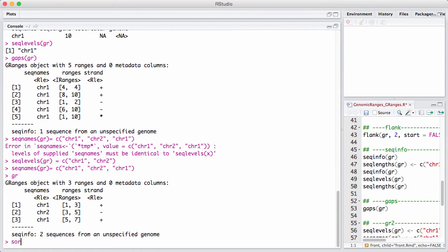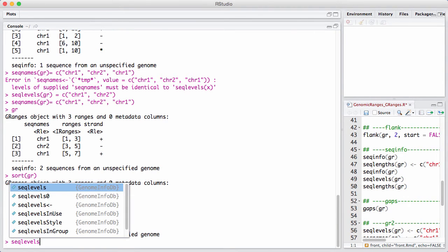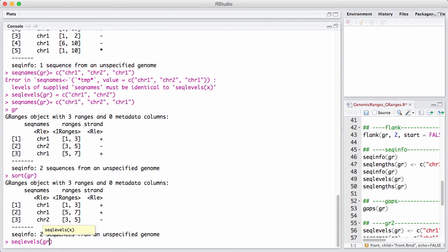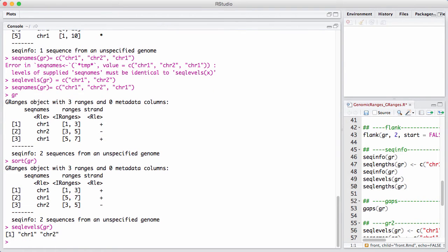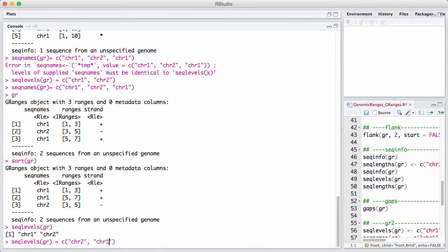Often we sort GRanges, and the sorting order seems to be sensible here, but it's actually relative to the ordering of the seed levels. So here we have seed levels that are chromosome 1 and chromosome 2. Let's reverse that. So we are essentially saying that chromosome 2 comes before chromosome 1.